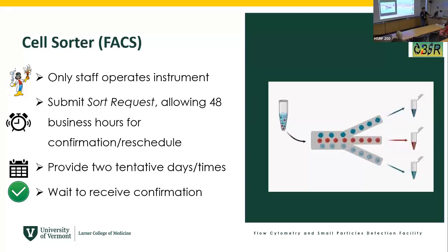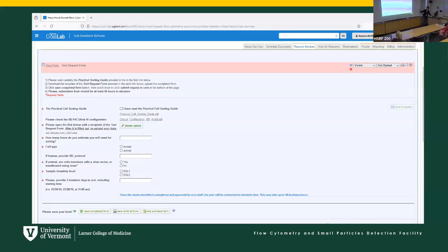Sometimes people send me an email today and say, hey, Roxana, I'm growing my samples, they are really ready, do you have time tomorrow? And I don't mind accommodating, okay? But you need to let me know. The fact that you submit via iLab doesn't guarantee that whatever day and time you submit will be processed.